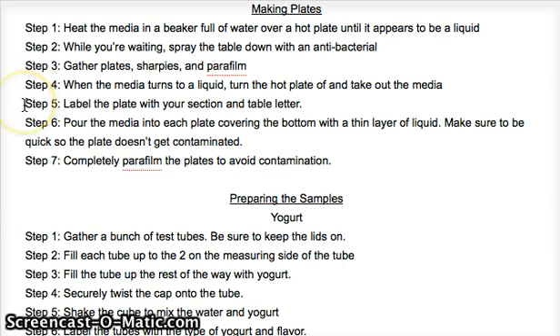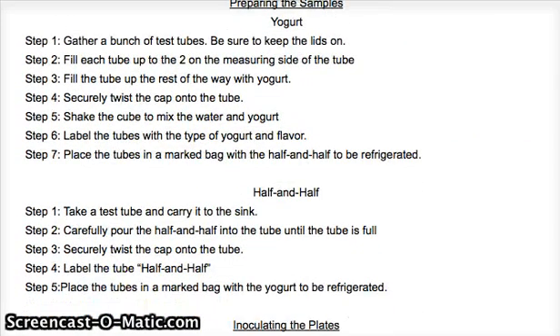You pour the media into each plate, covering the bottom with a thin layer of liquid. You have to make sure the plate doesn't get contaminated, because that would ruin how the bacteria grows. You parafilm it so you can see from the top to take pictures for the experiment. To prepare the yogurt samples, you need test tubes — keep the lid on so it doesn't get contaminated. Fill each tube with yogurt, add some water to water it down, securely twist the cap on, and shake to mix.